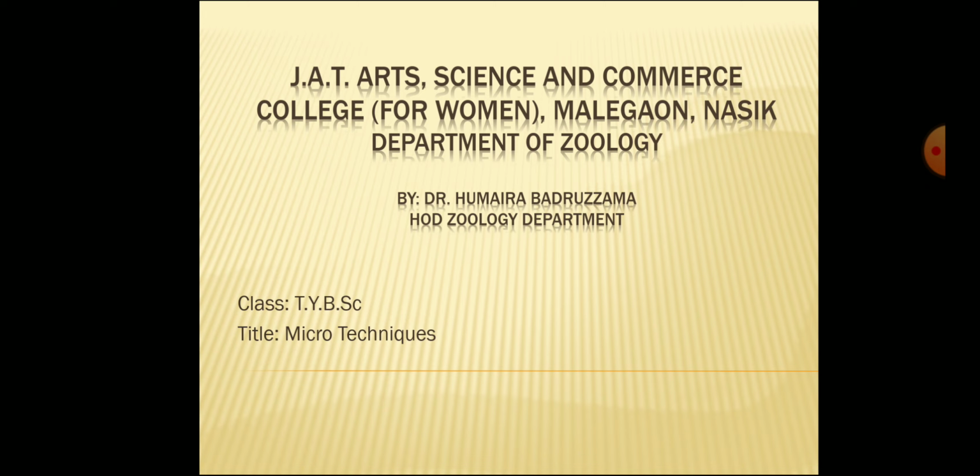Microtechnique involves a number of steps like collection, preparation of material, fixation, dehydration, clearing of material, embedding, cutting of the block into sections by microtome, section staining, and then mounting of the section on a slide. So first of all, we will study the microtechnique steps one by one.